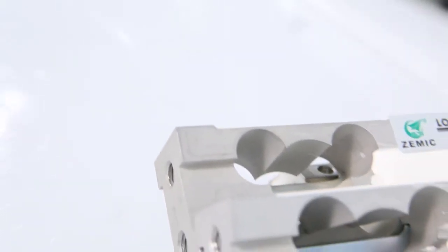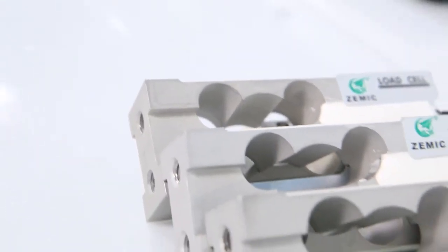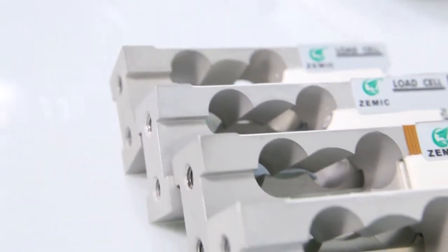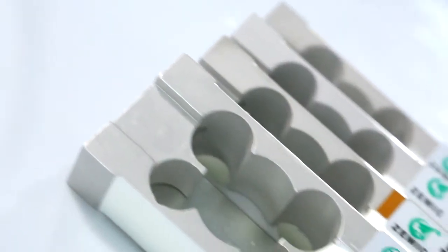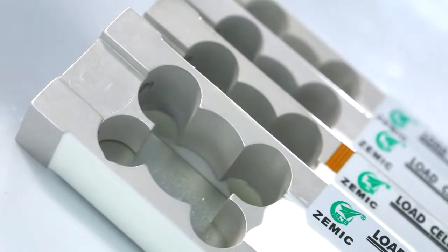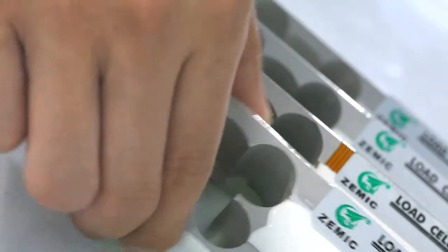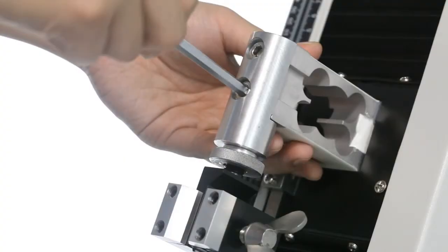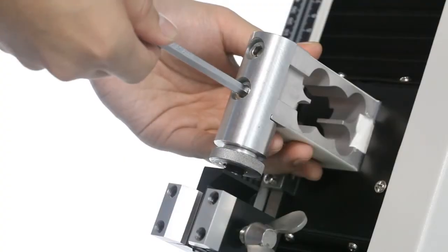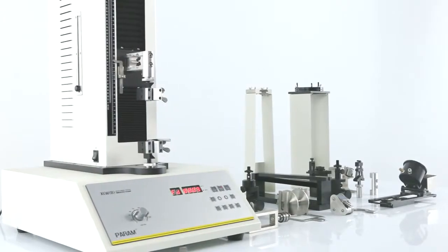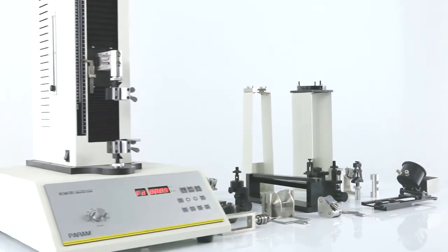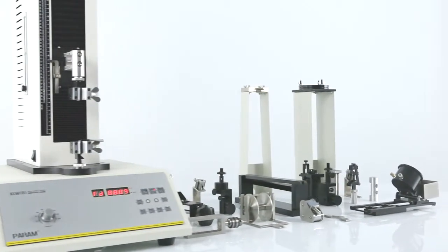Four high precision load cells of 30N, 50N, 100N, and 200N can satisfy different testing requirements.